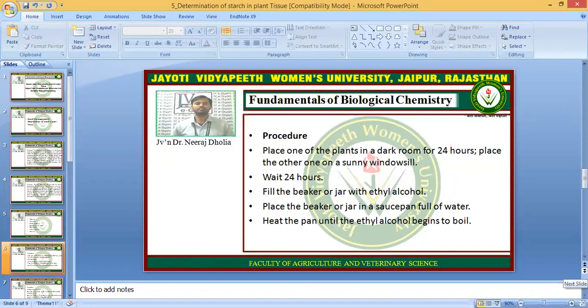For the procedure, place one of the plants in a dark room for 24 hours and place one on a sunny windowsill. Wait 24 hours, then fill the beaker or jar with ethyl alcohol.